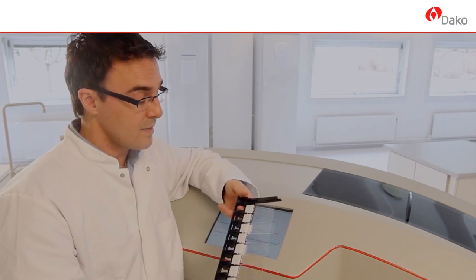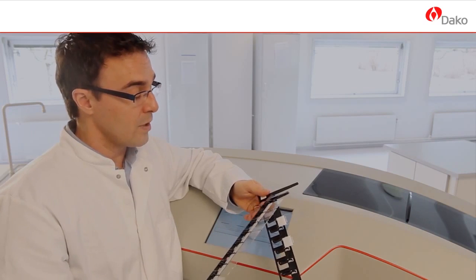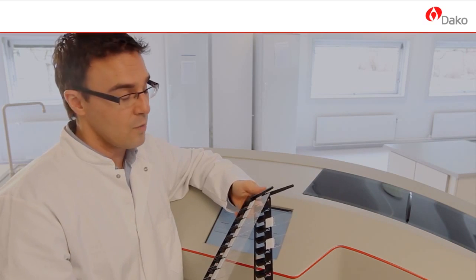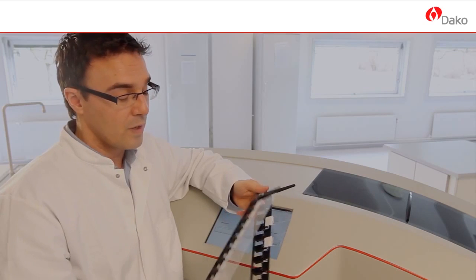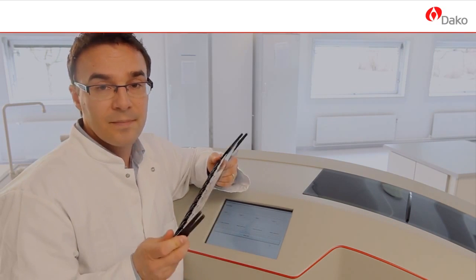Each rack can hold 1 to 10 slides. You don't need to fill them up. That's entirely up to the user. You can use 1 slide if you want to, or you can use 10 slides if you want to. You can use anything in between as well.